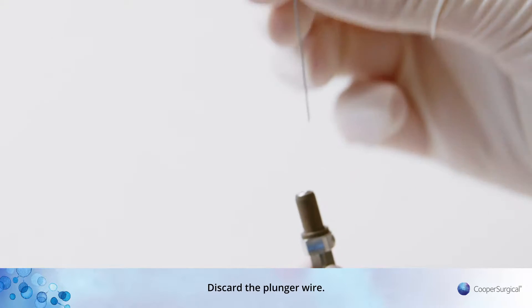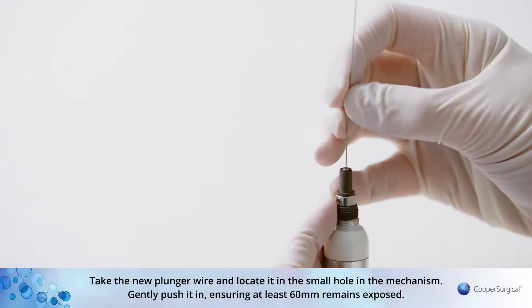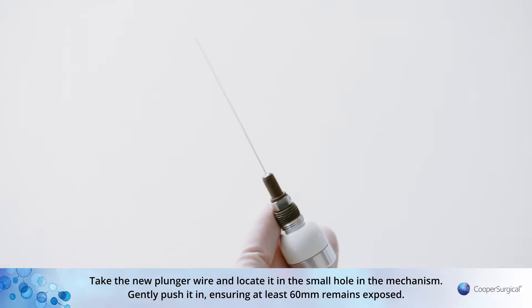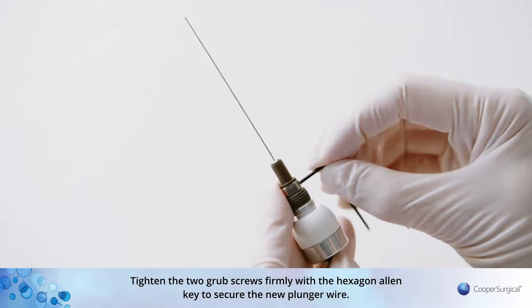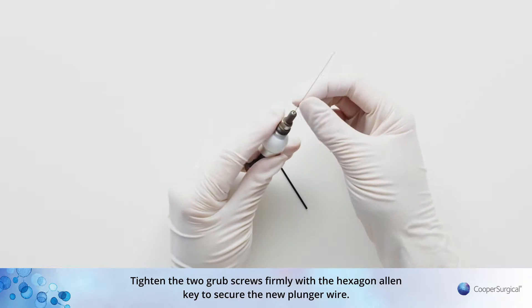Discard the plunger wire. Take the new plunger wire and locate it in the small hole in the mechanism. Gently push it in, ensuring that at least 60mm remains exposed. Tighten the two grub screws firmly with the hexagon allen key to secure the new plunger wire.